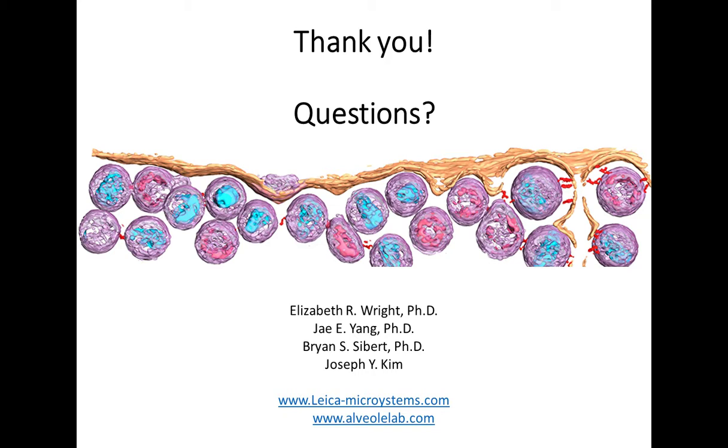Yes, thank you. So we have found it to be compatible with all carbon EM grids, and we've used a variety of those grids in our lab. Other groups have also had success with silicone substrate grids, and I would direct people to the PRIMO and Alvéole website to really see the versatility of what PRIMO can be used for.